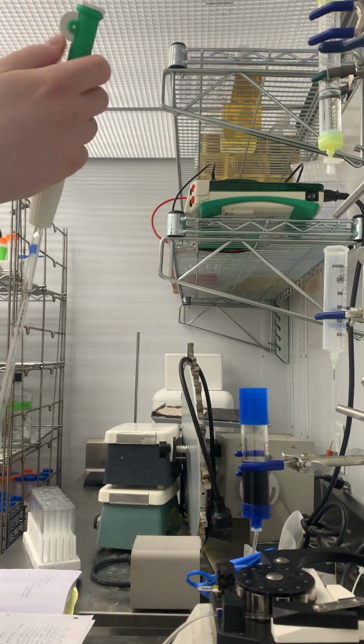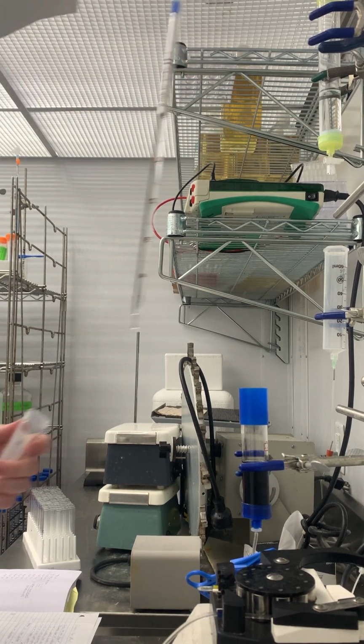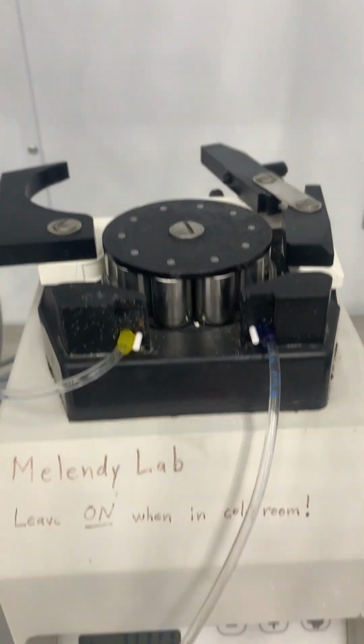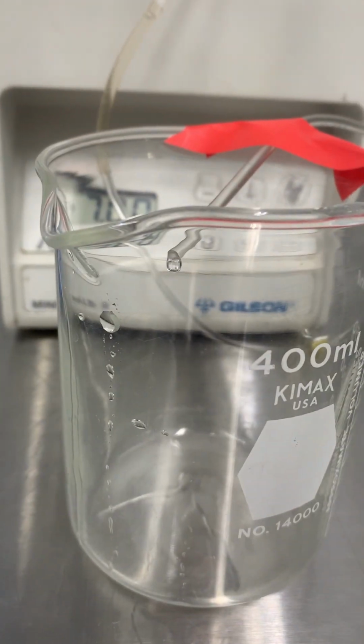The sample that contains the protein to be purified is added to the top of the column and allowed to bind to the dye. The sample passes through the column and the rest of the liquid in the sample is drained out, since the protein we want is bound to the blue in the column.